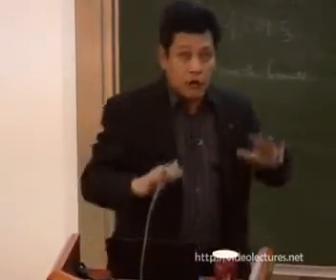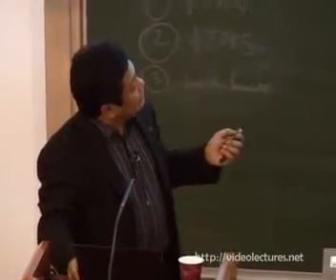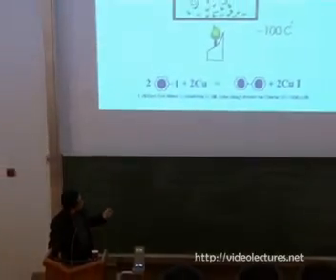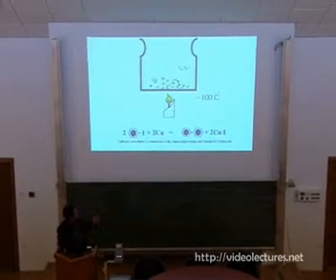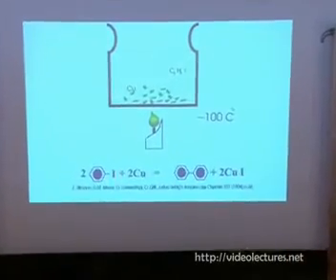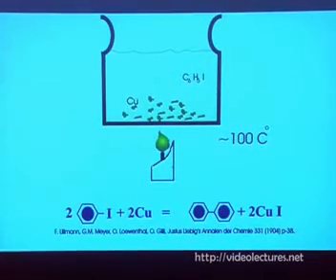All right, so I'm going to give you a few examples before I go to the final results and the key subject of today. This is an example of a chemical reaction that we realized. This is not my work, I'm sorry. This is the original work published in 1904, 100 years ago, called the Ullmann reaction, where we put copper powder into iodobenzene liquid and heat it up, and then we have this chemical reaction. Iodobenzene plus copper results in biphenyl, this molecule, plus copper iodide.